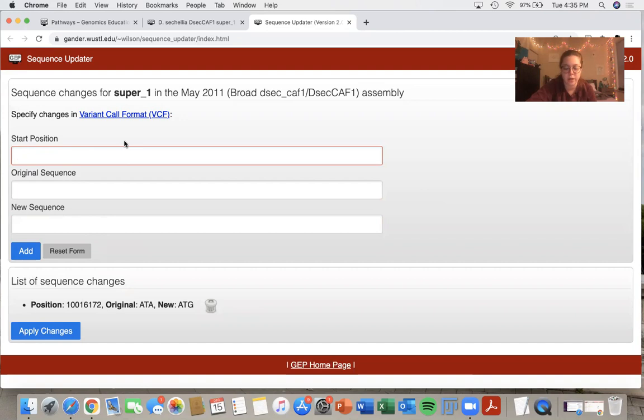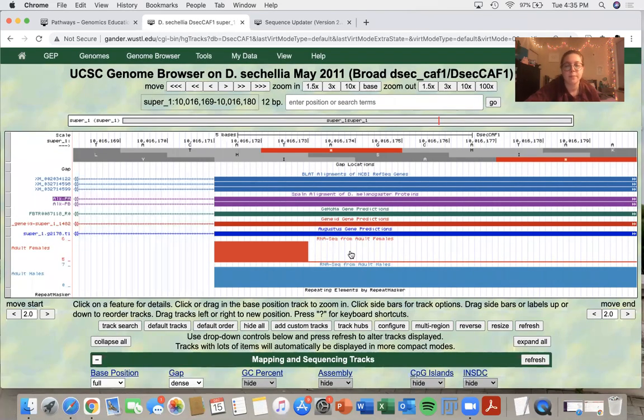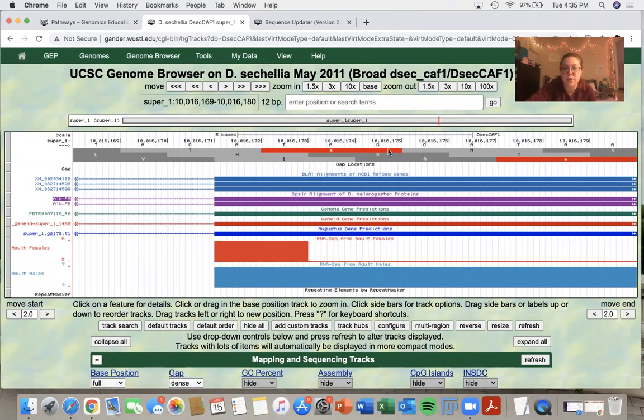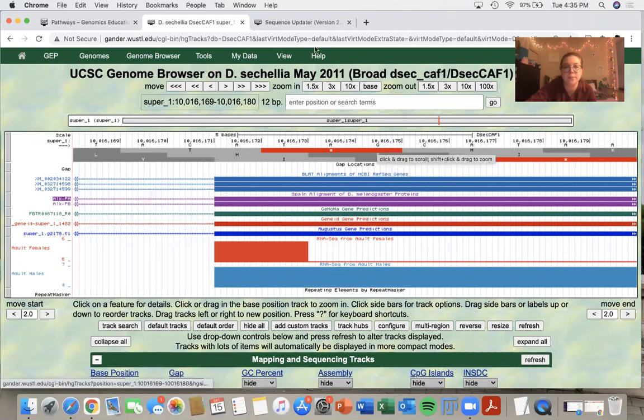So for the next one, I will show you what an insertion would look like. So back on the genome browser, say I wanted to start at this base right here, 10,016,175, we have a G.